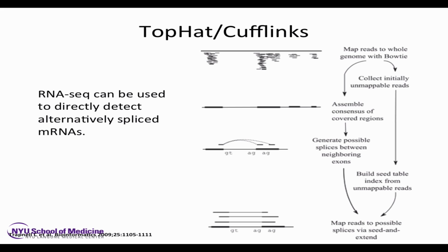The problem with aligning RNA-Seq reads onto the genome is obviously the introns. The introns have been spliced out of the RNA, and so when you try and match the RNA read onto the genome, you come to a large region of intron sequence in the genome where the RNA fails to match. You need to create a giant gap of unknown size and figure out where the alignment picks up on the other side of the intron. As Adriana mentioned, genes that have tiny exons and big introns create an even bigger challenge for the alignment algorithm.